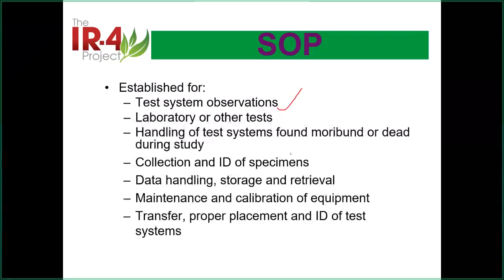Okay, so how you do the tests, how you handle the system, how you give the name, collect the data, how you get the sample related information there, how you handle the data. Sometimes you may have different ways to handle, but because it's routine based, you need to give it in the SOP to specify how you do the work.